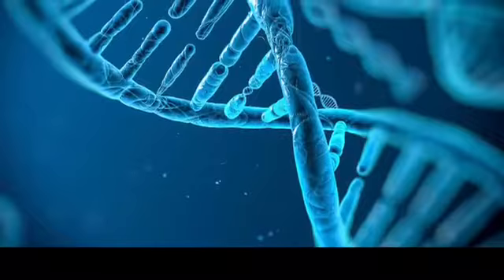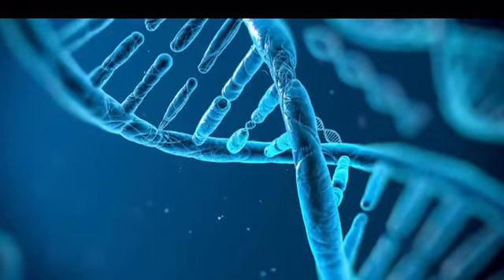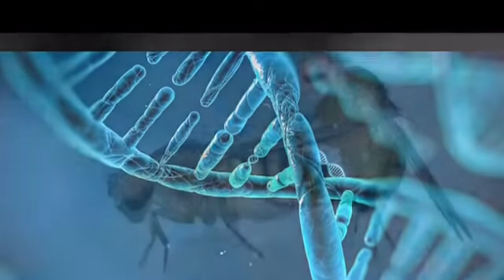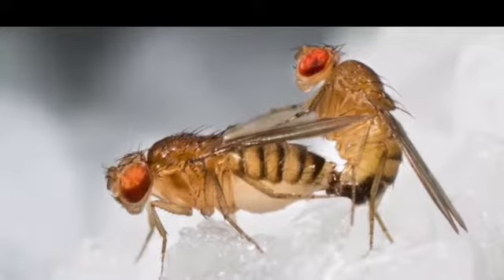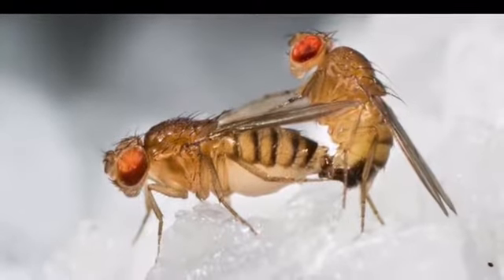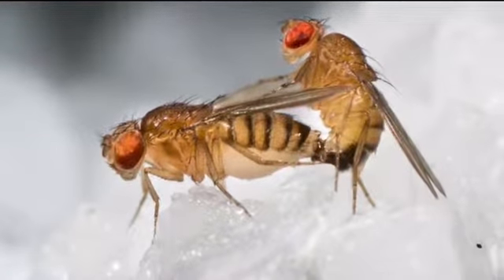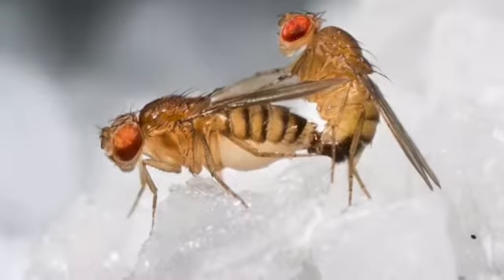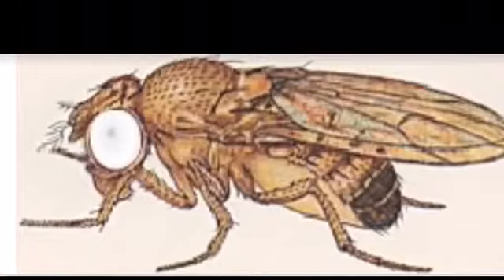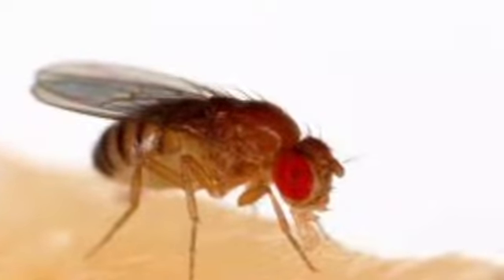This experiment was conducted in order to observe how a mutation is passed on from a parent to an offspring. Fruit flies were used to observe how a mutant trait and a dominant trait affected a progeny. The fruit fly was used due to its rapid reproduction cycle and the ability to live in a laboratory setting. The mutation being studied in this experiment was a white-eyed mutation. A non-mutated, also known as a wild-type, fruit fly has red eyes.